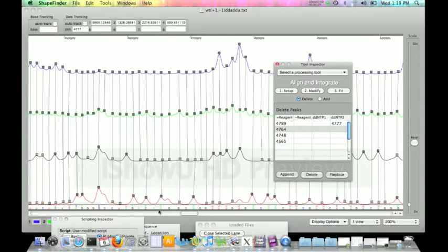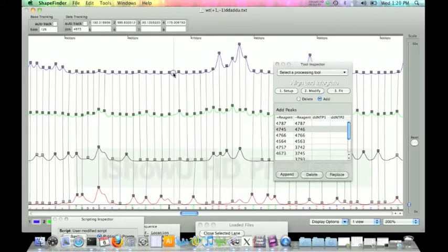shift starting here. So a big factor is look for the positions where your data is lined up versus where it's not lined up, and then look in that region for a position where you think a peak might be, that might not necessarily be a very clearly well-defined peak. So I'd say there's definitely one in here. We'll see how that affects our sequence. There we go, beautiful.